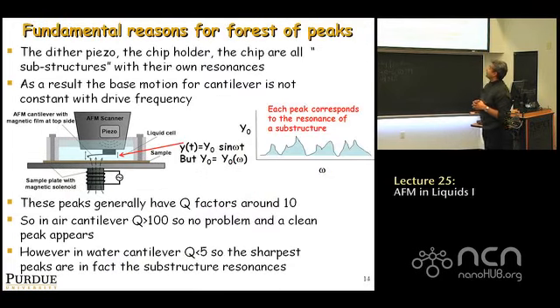So, remember, what is happening here is you've got somewhere embedded behind your holder a piezo, right? You apply an oscillating voltage, so the piezo starts to vibrate. As it vibrates, it starts shaking whatever it's attached to, right? Whatever it's attached to is going to be attached to the chip holder. So the chip holder starts shaking. The piezo itself has its resonances. There are certain frequencies at which the piezo will shake more, certain frequencies at which it doesn't shake much, right?